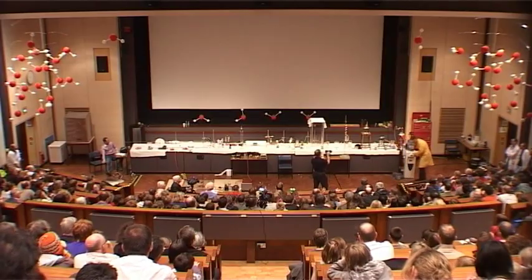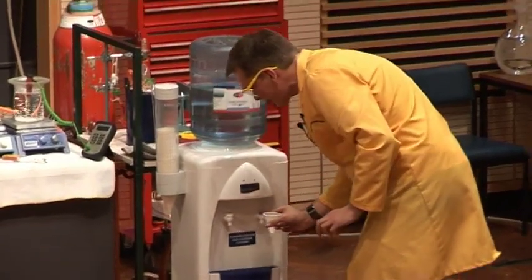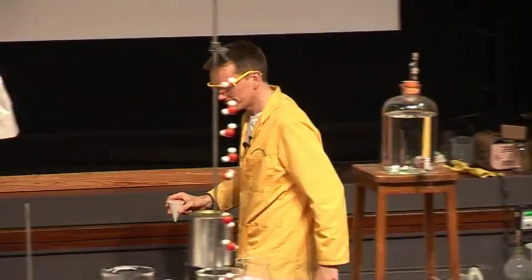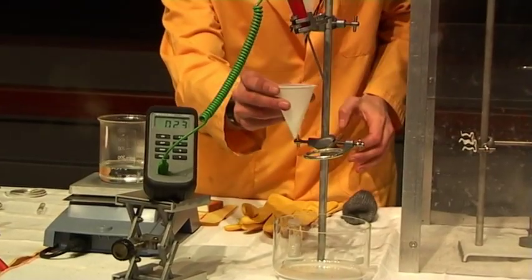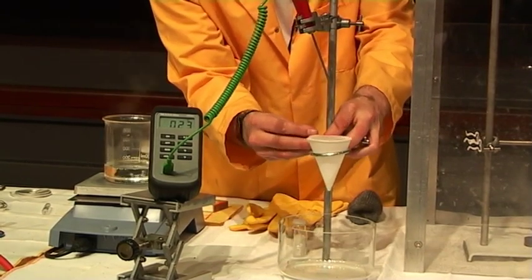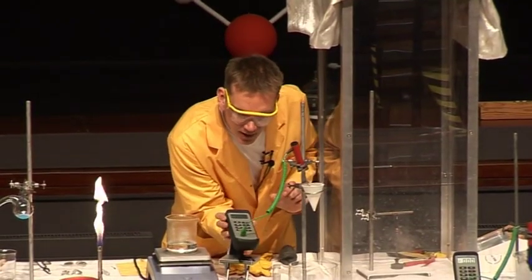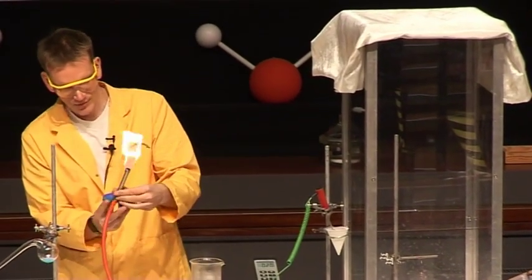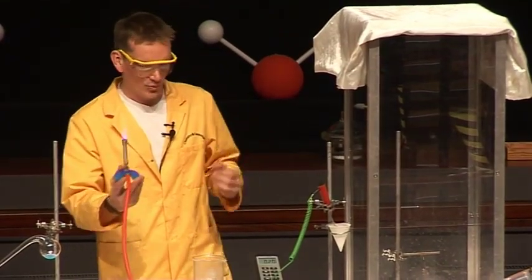So I shall take some water in my paper cup here, fill it up with water, and we're going to test to make sure that water boils at 100 degrees C. So I'm going to bring it round here, and we're going to heat it up. We'll check the temperature. There we are. So the temperature now is at 20 degrees. I'm going to heat it up with a Bunsen. Okay. Now, is this a sensible thing to do? Is this a good, well-designed experiment?